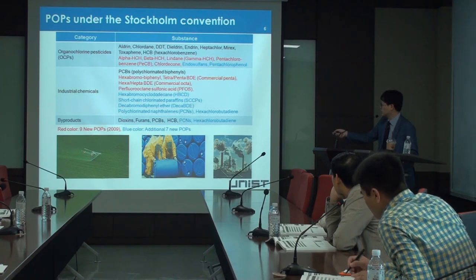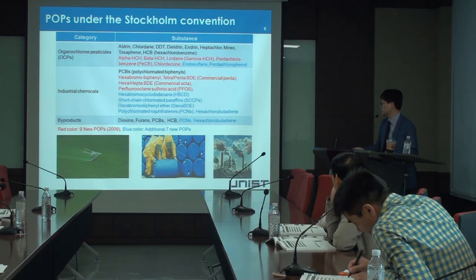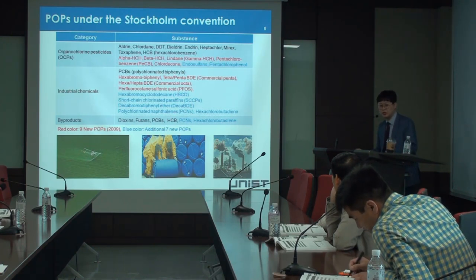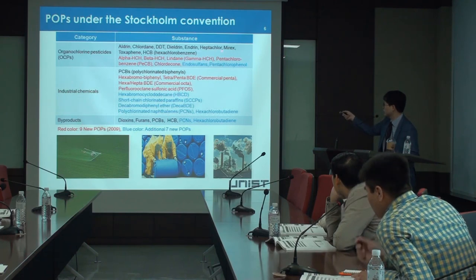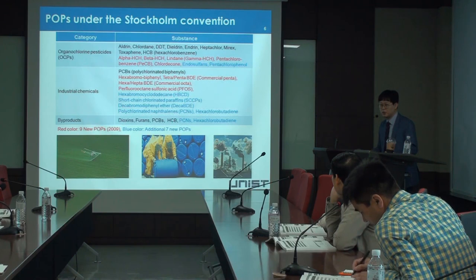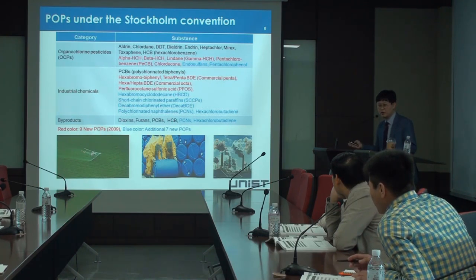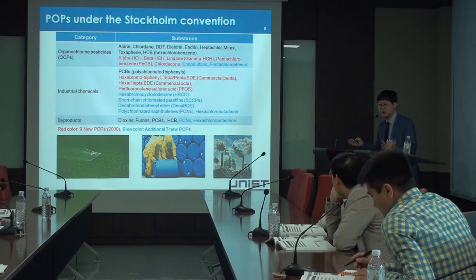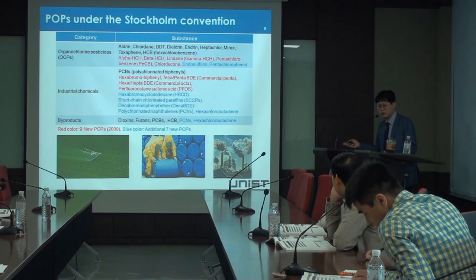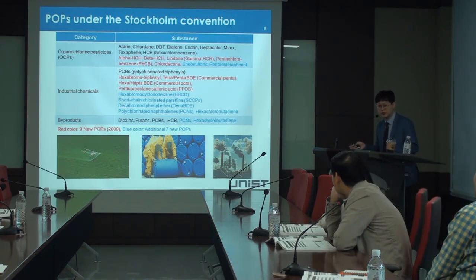Here the red color is 9 new POPs, and the blue color is an additional 7 new POPs. When the Stockholm Convention was initiated, we focused on 12 chemicals. But year by year, the Stockholm Convention adds new chemicals. So the POPs problem, the analytical method development, and the target chemicals are never-ending.